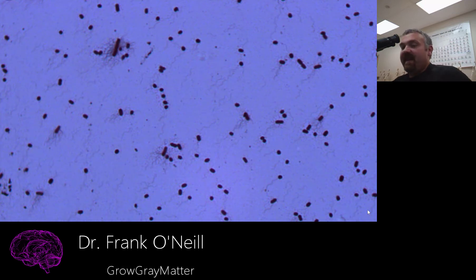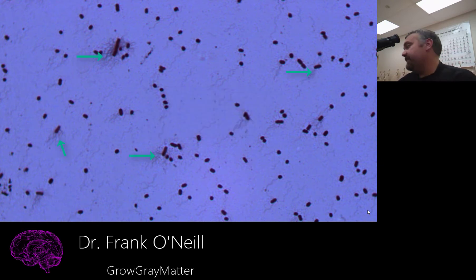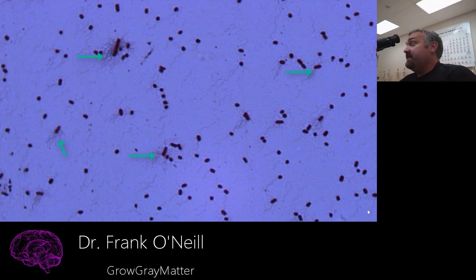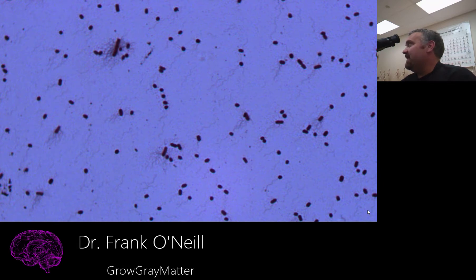Now you can see Proteus vulgaris in all its glory, and you can also see some of the many peritrichous flagella. If you can get to this point, I would say you are a very advanced user of the microscope — you can see bacteria, which are small enough to begin with, and you can even see their tails. I hope you enjoyed this. Go and look at as many structures as you can throughout the world, and enjoy your time learning about the amazing world around us. Have a wonderful day.